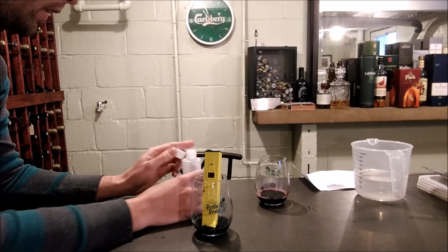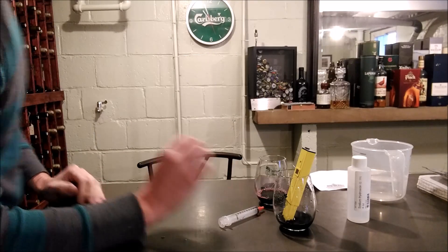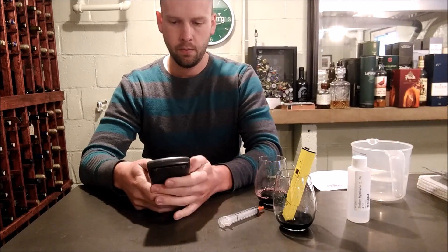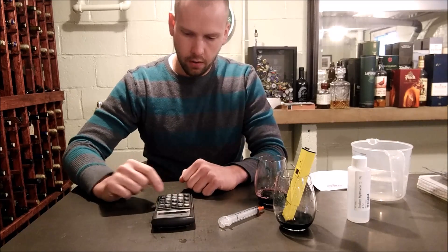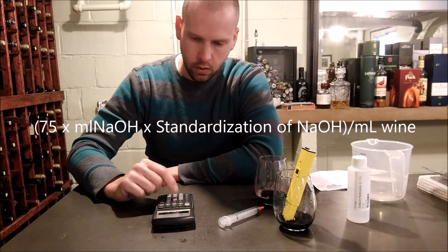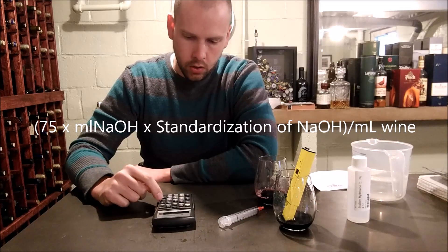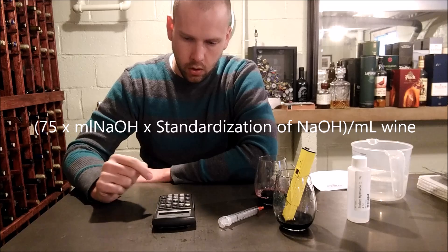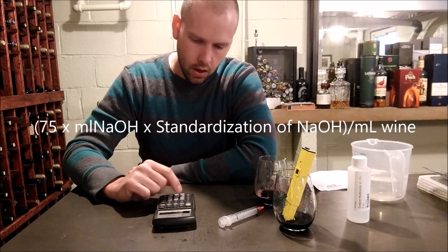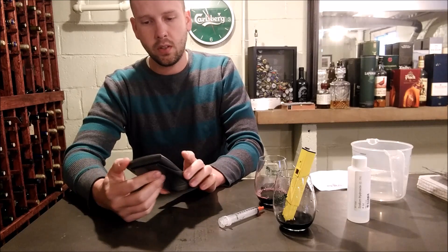From there I need to do a calculation. The formula is: 75 times the milliliters of sodium hydroxide used — so 9.5 — times the concentration of sodium hydroxide — 0.1 — equals 71.25, and then divide by the milliliters of wine sample — 15 milliliters — which gives us 4.75 grams per liter of tartaric acid.